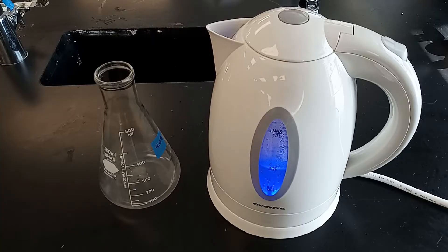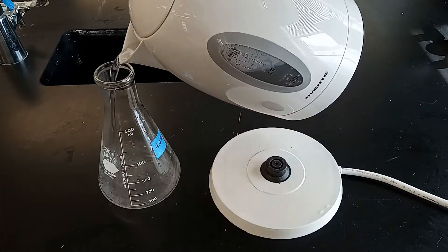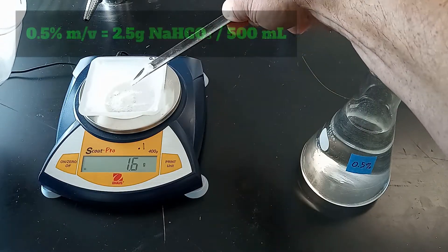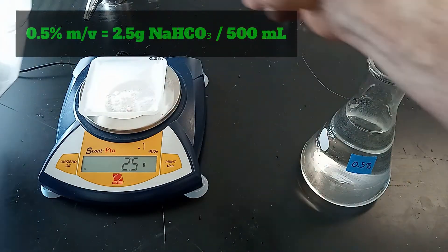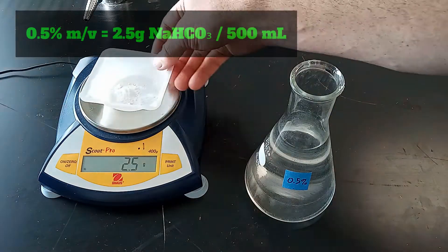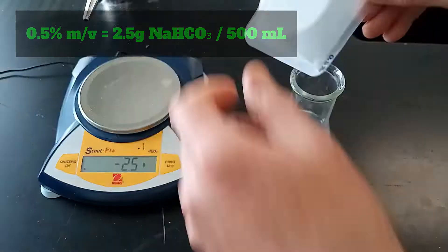I boiled water a day before doing the experiment to remove dissolved gases, including carbon dioxide. Sodium bicarbonate solutions ranging from 0 to 4% in 0.5% increments were made by adding baking soda to 500 milliliters of degassed water.